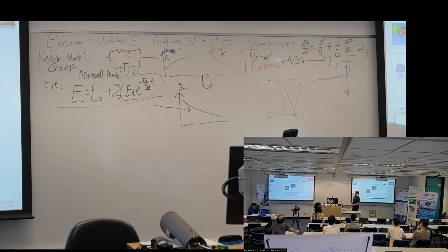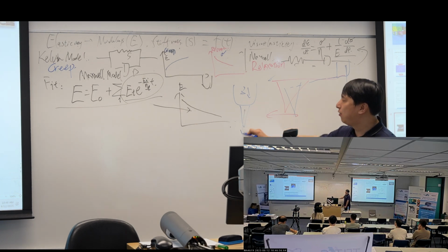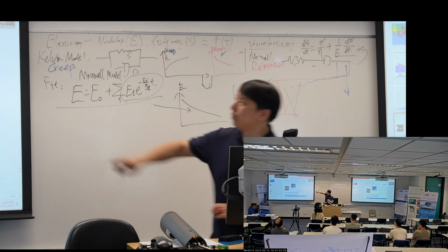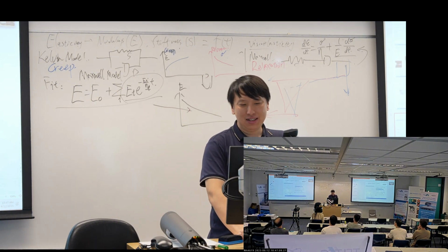It cannot do the force as AFM did on polymer or the cells, but it can apply large force because their indenter is the perpendicular one. So their Z scanner is on top, so they can apply force perpendicularly. So that's the reason. So Bruker also has this kind of probe, but not very popular.